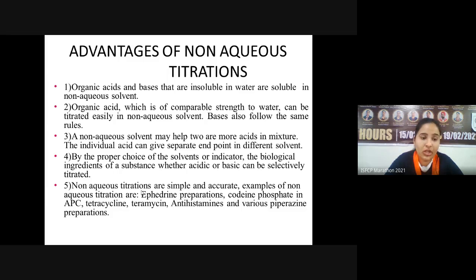The individual acids can give separate endpoints in different solvents. So by using non-aqueous solvents, we can perform the titrations of two or more acids which are going to give different endpoints in the different solvents, and find out the endpoint of more than one acid.